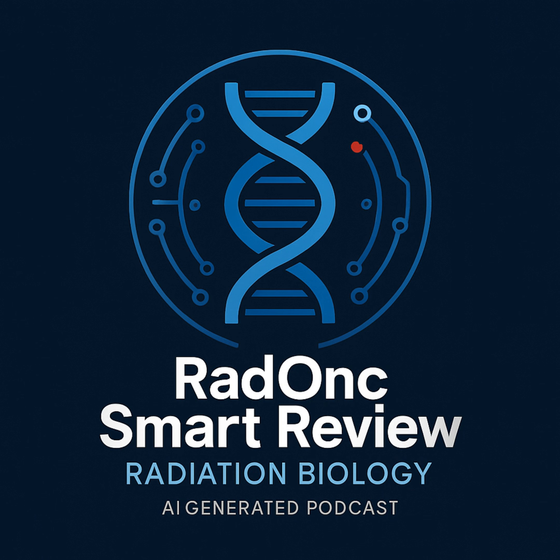All right, moving beyond just detecting molecules, sometimes you need the exact sequence, the ATCG order: DNA sequencing. We'll start with Sanger, the classic method. And now we have the massive power of next-generation sequencing, NGS. Tell us about Sanger first, the chain termination method. Right, developed by Fred Sanger, a huge breakthrough.